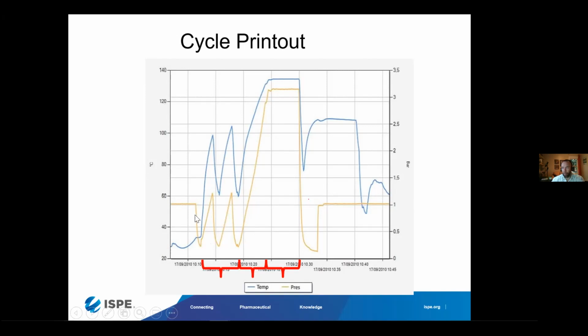So this is really, from a sterility standpoint, the most critical three phases of the cycle. That's why we have biological indicators to confirm sterilization and the Bowie-Dick test to confirm the pre-vacuum pulsing. At the end here, we have drying and cooling just to be sure that our equipment upon removal is safe for use.